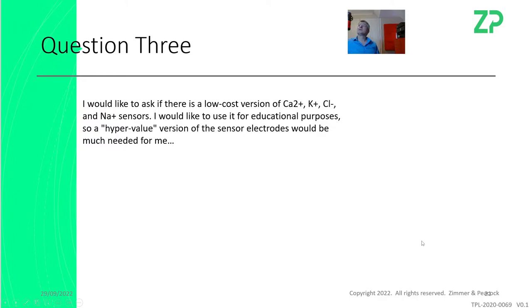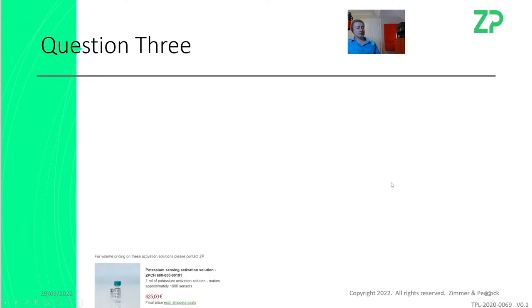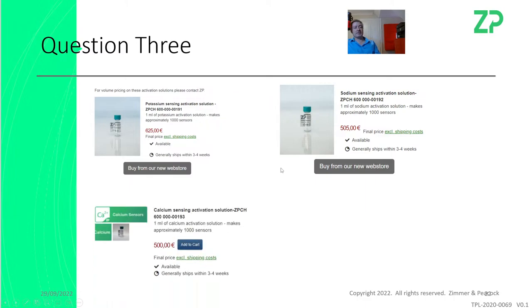Question number three, it's 8:31, so I have to be quick. The questioner would like to make a low cost calcium, potassium, chloride and sodium sensor. They'd like to do it like on the hypervalue electrode. So we do have these sensors. I understand in a teaching lab, they can be quite expensive. And so what I suggest is we do actually have these solutions. You know, we have these solutions, potassium, sodium, these are activation solutions.